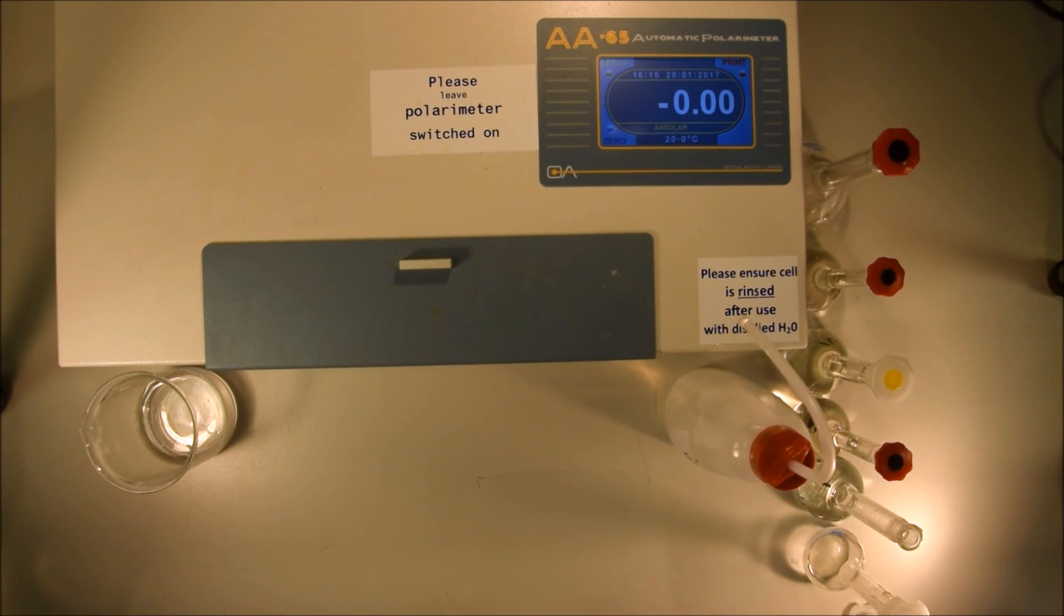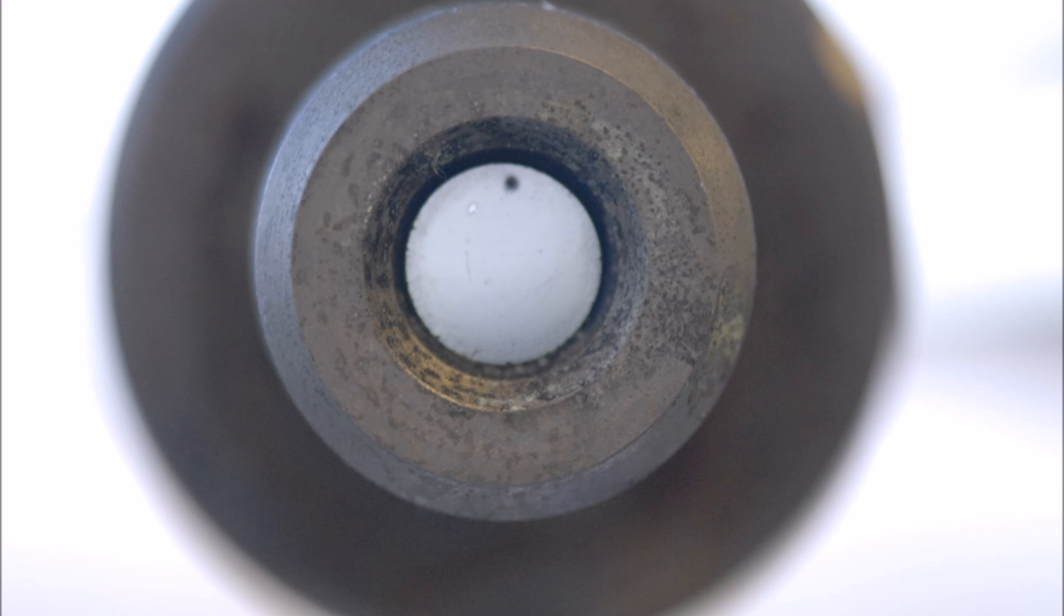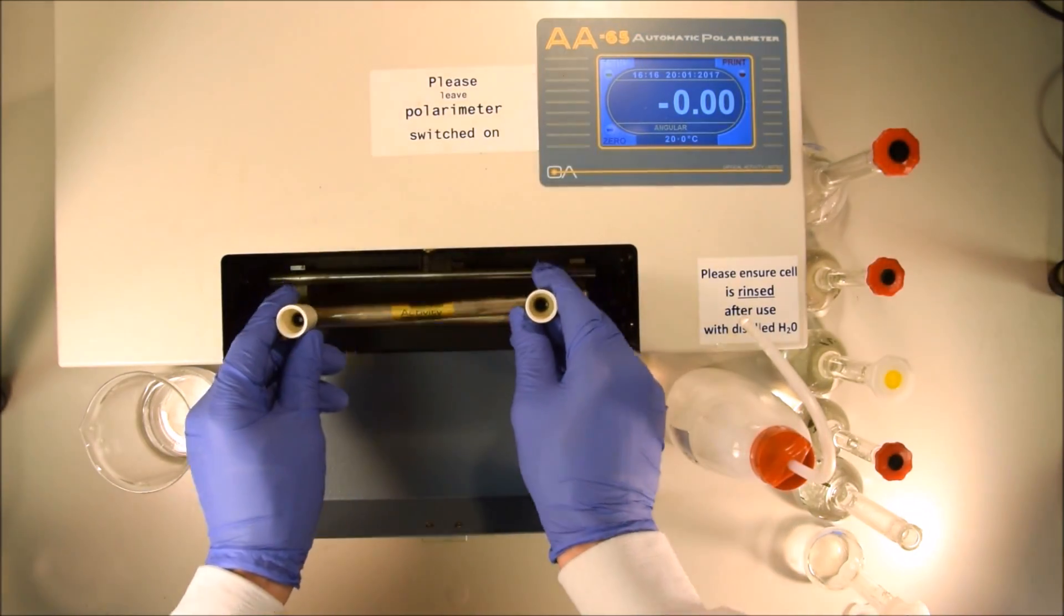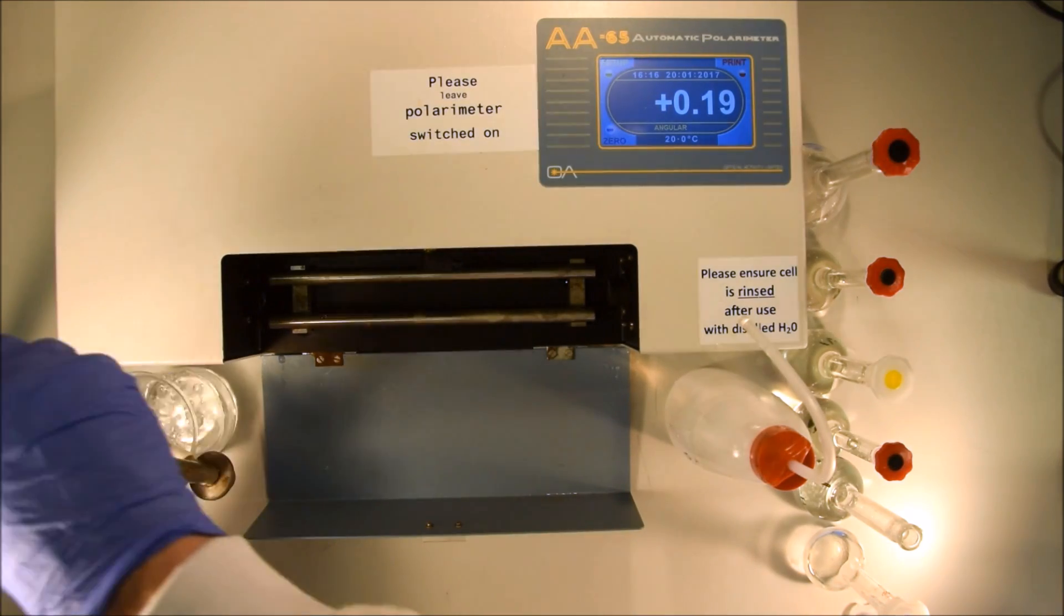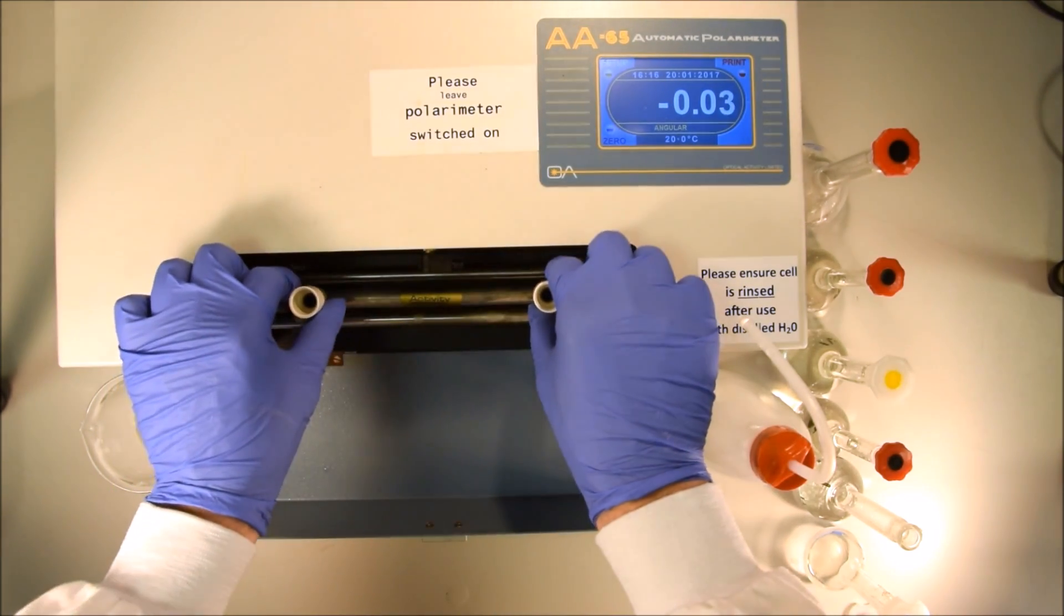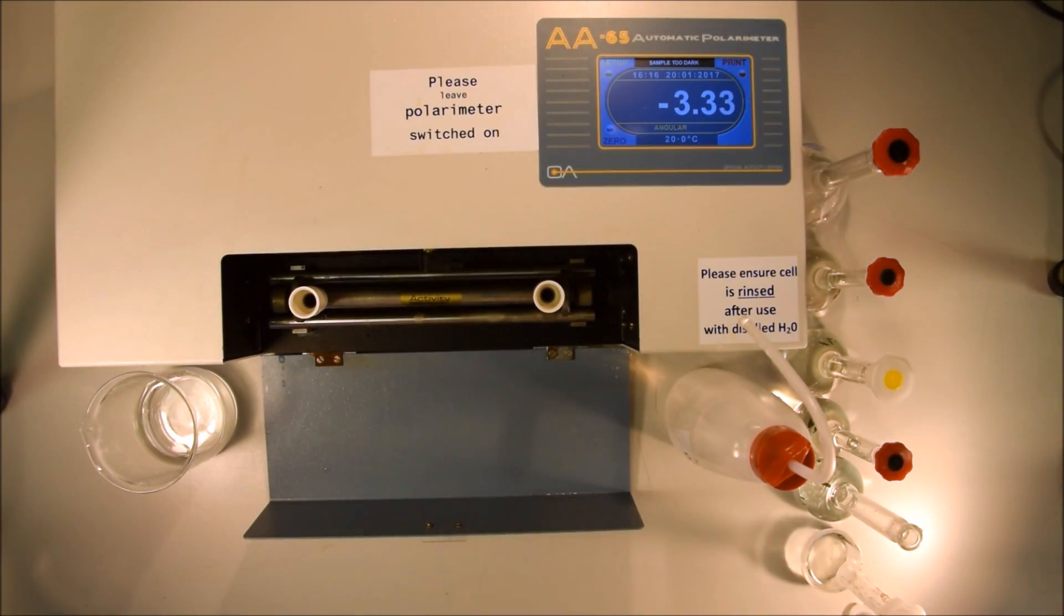Another thing you have to be careful about when filling your cell is that there are no bubbles inside. If there's no bubbles inside your cell, when you look through it, it should look like this. You can see from one end to the other, there's two quartz windows on either end of the cell. On the other hand, if you don't have your cell completely full and you have a bubble in the way, you'll see what happens now.